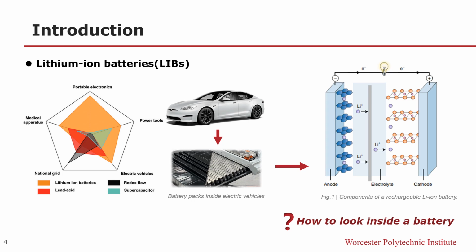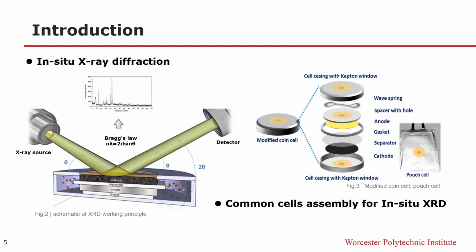electric equipment. Apparently, since lithium ions continuously insert and extract from electrodes during charge and discharge cycle, complex reactions might occur, such as electrode degradation, phase transitions, and reactions at the electrode or electrolyte interface, which have negative impact on the final energy density and working life in practical applications. Thus, it is important for us to find out what happened inside the batteries during the cycling process. In-situ XRD helps us solve the problem.